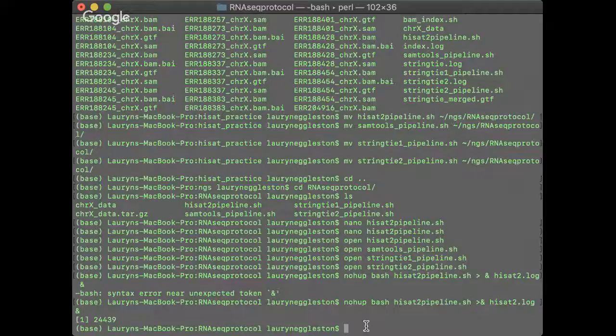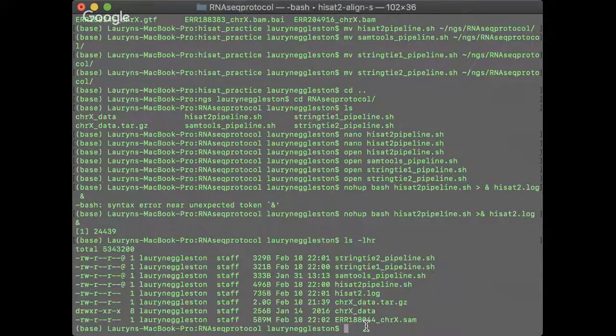So, this should be good. I ran it in the background when I was doing this the first time, so I could work on other things, but let's see. Let's check on it. So yeah, you can see that it's getting through making some of these SAM files, so when it's done. But yeah, I'm just gonna hang out until then.